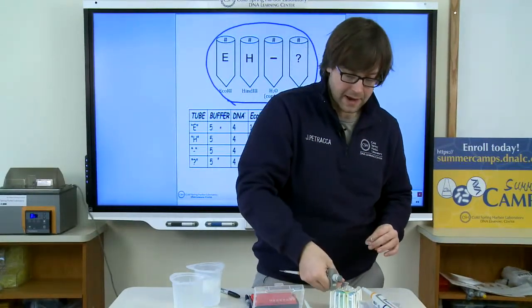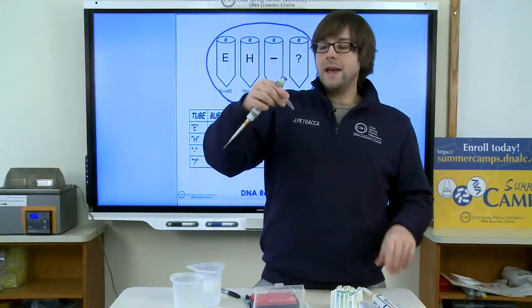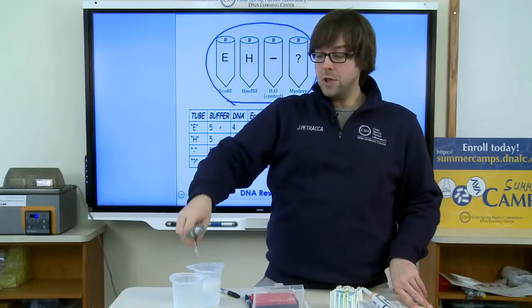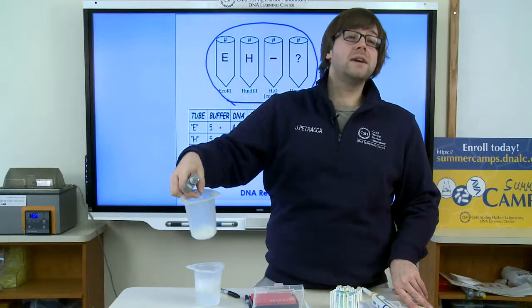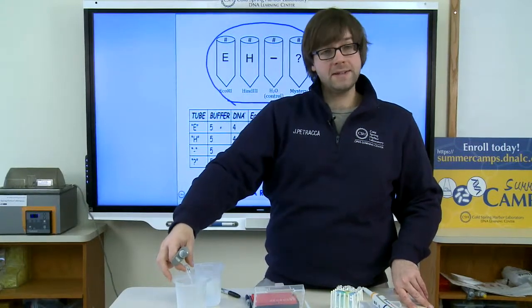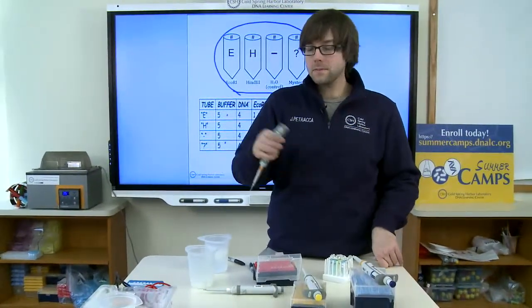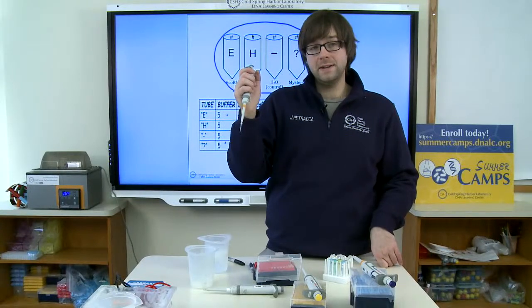Okay, so now that my buffer's all in the proper tubes, I can go ahead and get rid of the tube that the buffer originally came from. So on the table here, I have a little beaker, and this is basically going to be for my science waste throughout the day. So all of my empty tubes, all of my pipette tips, whatever is science-y, is going to go in that garbage. Okay, so I'm going to change my pipette tip now because I'm going to move on to the DNA.